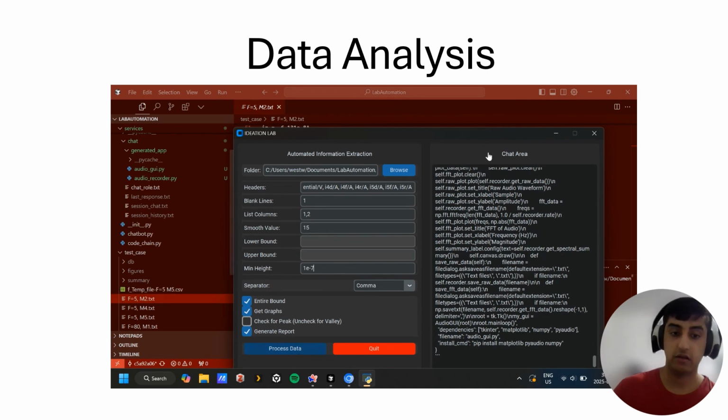And the interesting thing to see over here is you're able to get the graphs automatically generated and labeled. We're also able to generate a report as you're finishing up your experiments. So you wouldn't have to write anything on your own. It's able to summarize everything.